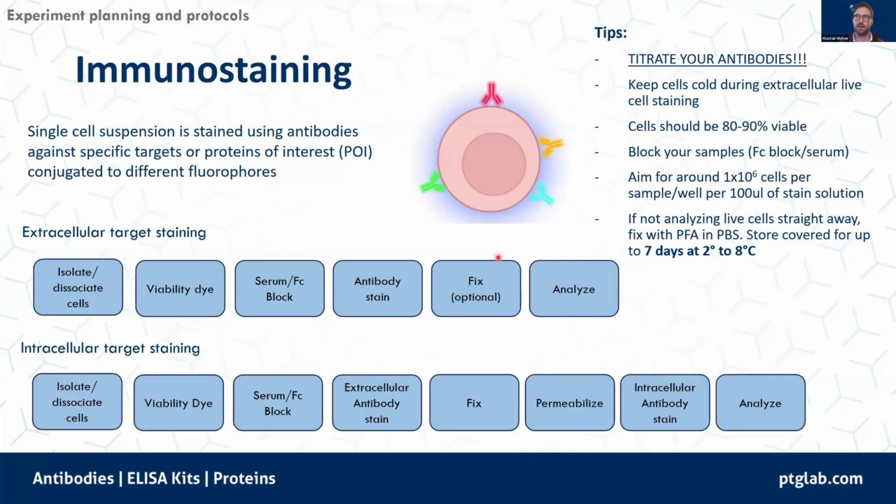And I've obviously commented already about how long you can keep your cells after fixation. It just allows you a bit of flexibility if you've had a long protocol and you can't get onto the cytometer that same day.